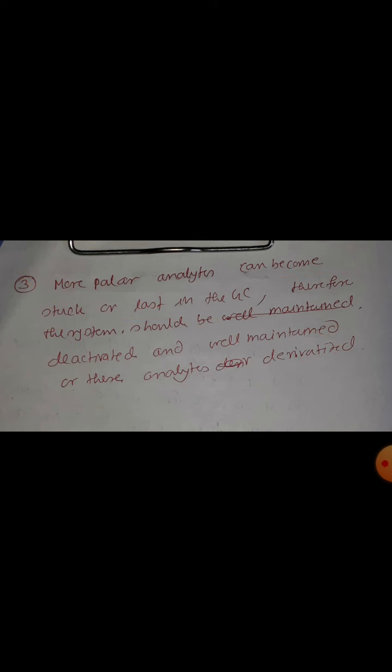Then, more polar analytes can become stuck or lost in the GC. Therefore the system in such cases should be deactivated first and then well maintained, or the analyte should be derivatized. So those are the disadvantages or limitations.